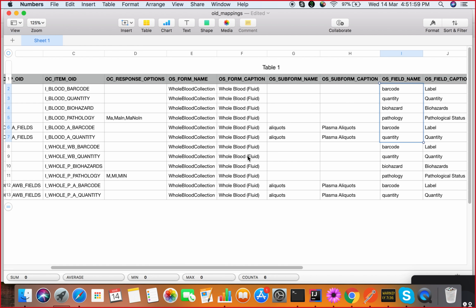Always, yeah. No, can you come back again? Maybe I lost there. What was the discussion? No, I think it's okay. We discussed. Basically, this is the field name that OpenSpecimen uses. You will never encounter these fields unless you are writing AQLs on your own. But this is here so that I can identify.